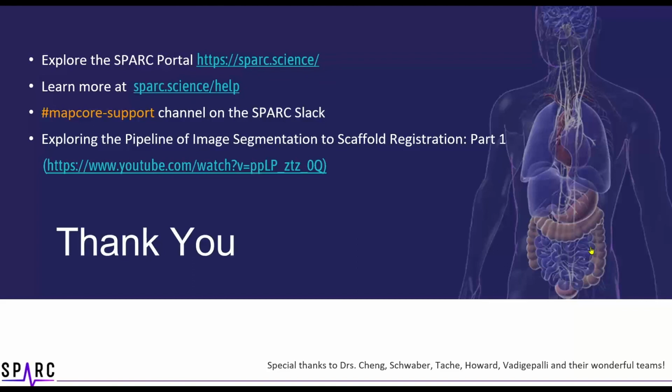We didn't show it in this presentation, but for example, for bladder and stomach, we have information about the individual layers. In bladder, we can have the information from the luminal layer and the serosal layer, and the stomach has multiple layers from mucosal all the way to serosal and all the muscular layers. The scaffold allows for creating these layers if the information is available or given by the image. That's one of the features of the scaffold.